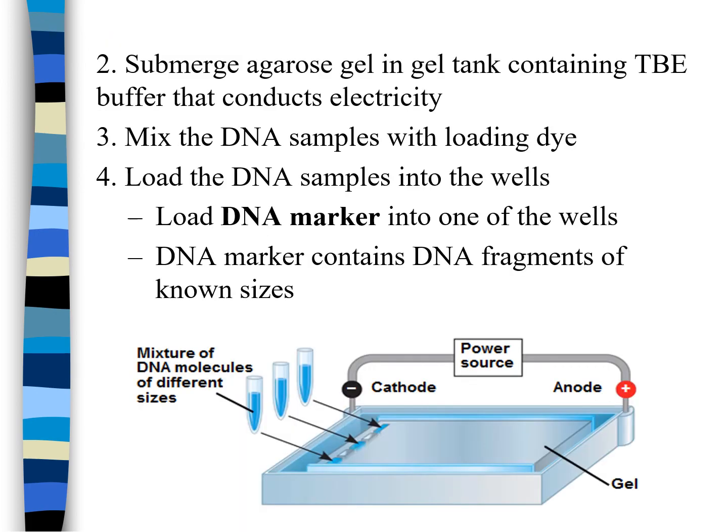but the main thing here is to notice how they're adding their samples. They added the loading dye. So this is patient 1, patient 2, patient 3, let's say, and they're adding the samples into the wells. But before they added their samples, they added the loading dye. Notice it is blue so that it can sink in and they can track it. Of course, they already added the ethidium bromide inside the gel. And then they turn on the power and it will run from the cathode to the anode, negative to positive.